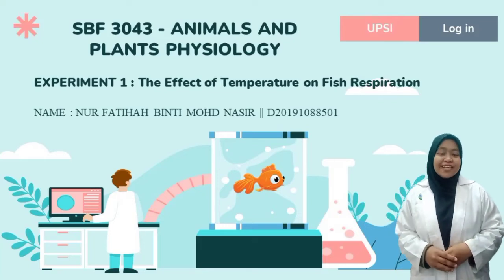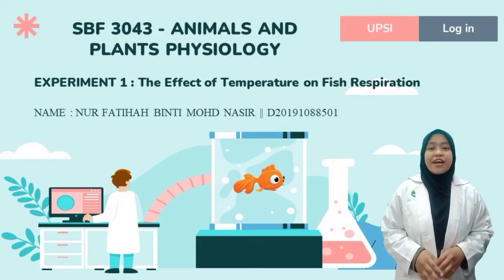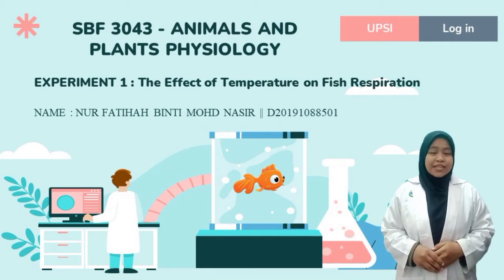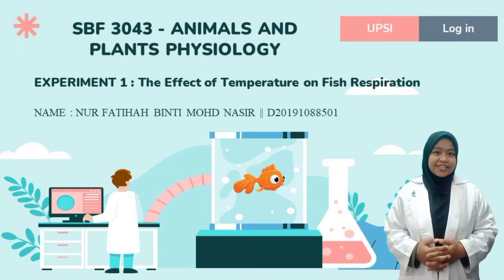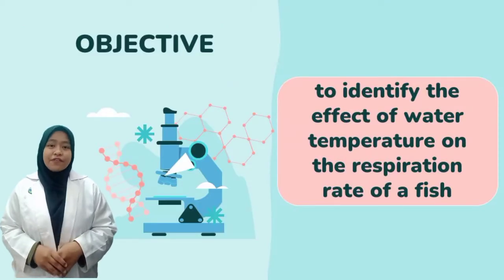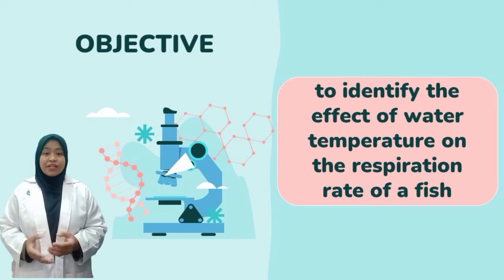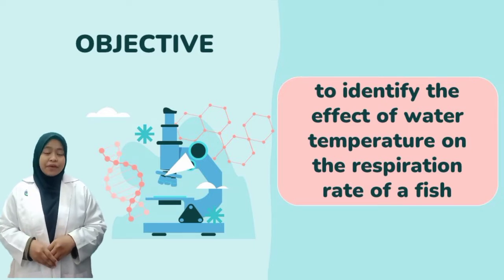My name is Nur Fatiha binti Muhammad Nasir, and today I'm going to carry out an experiment about the effect of temperature on fish respiration. So the objective of this experiment is we want to identify the effect of water temperature on the respiration rate of a fish.